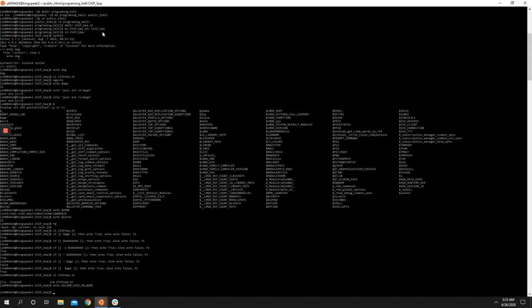So this is a good way to check if the user is logged onto a node. So if we say if this variable is not set, then we can add some nasty message that says echo get your butt on a node. So echo good.